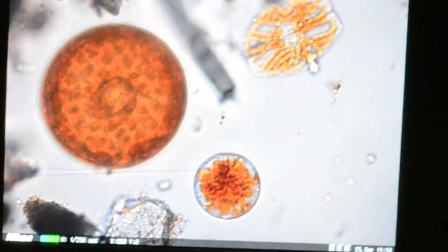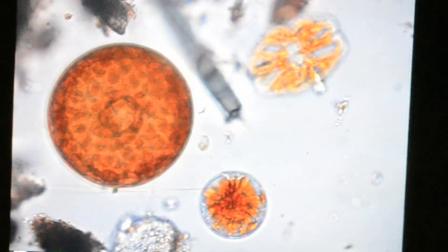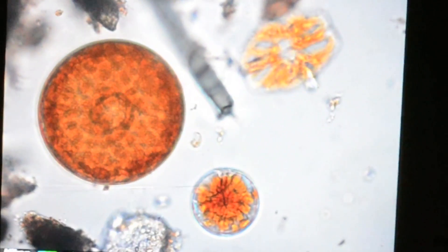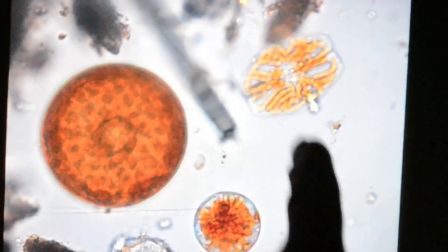You can see they're all about that same sort of brown color. This one down here at the bottom is another diatom. The genus is Actinocyclis. And then up in the corner on the right, this one here is another diatom called Membranius challengeri.